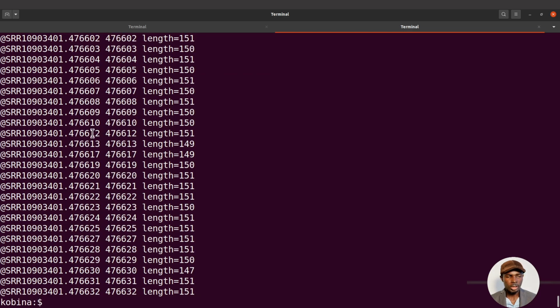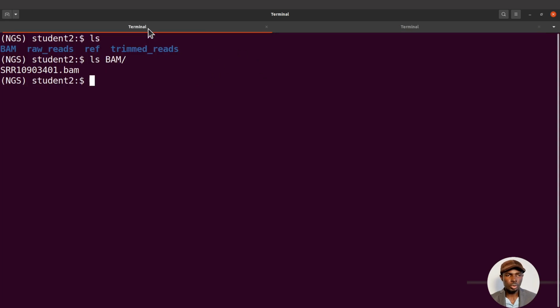Of course, we will not take all of them. We will only look at those that qualify to be non-human read pairs, i.e. those that do not map to the reference sequence. So that's it. Let's go back to our other terminal and then start the activity.